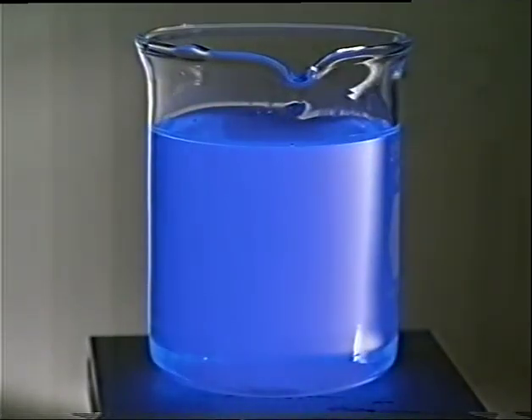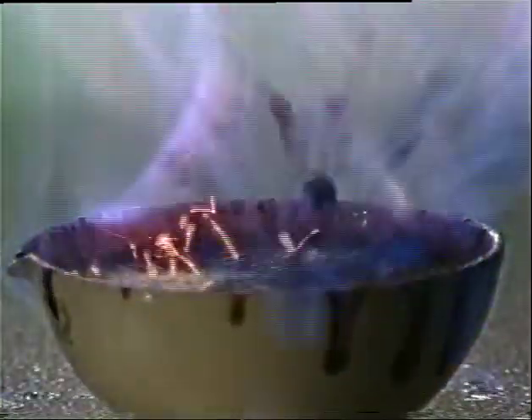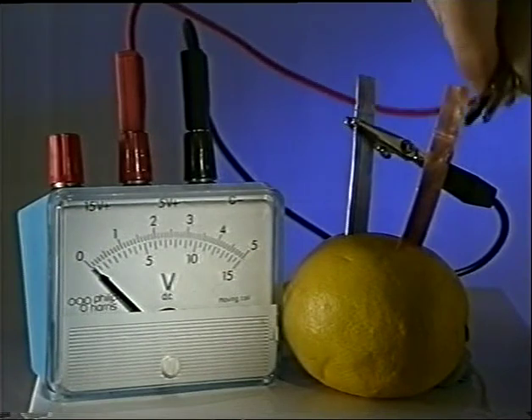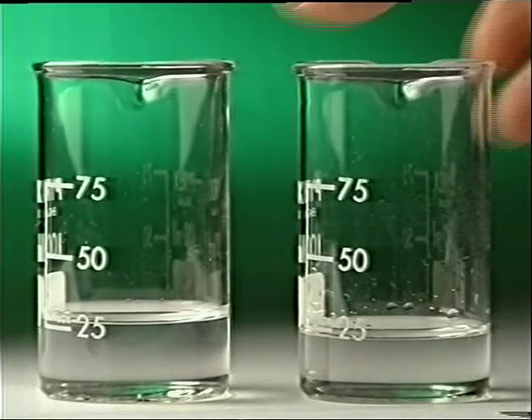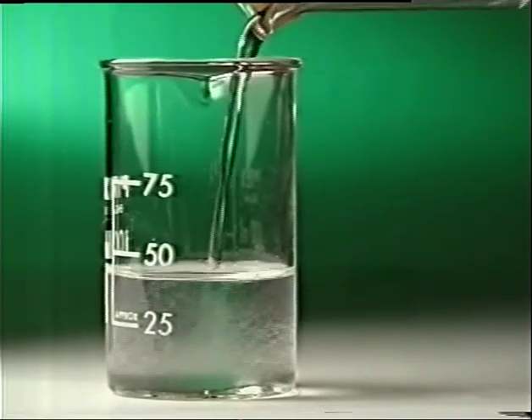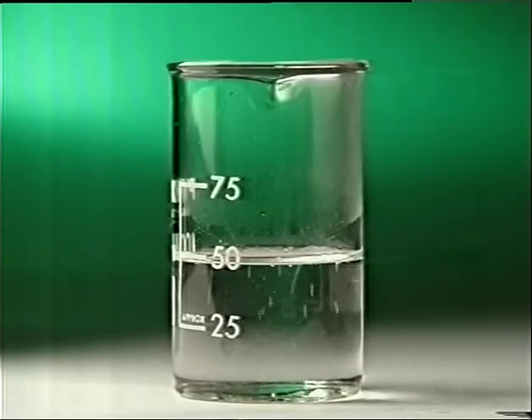Chemical reactions involve changes in energy. These reactions are giving out energy as light, heat, sound, even electricity. But there isn't an obvious energy change when sodium hydroxide solution is added to sulfuric acid. Take another look, this time using a thermal imaging camera.